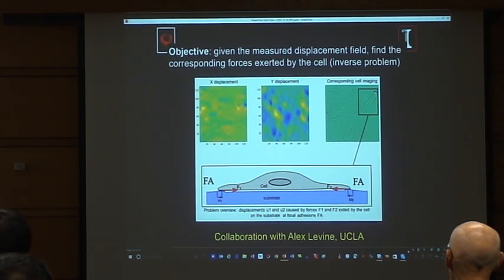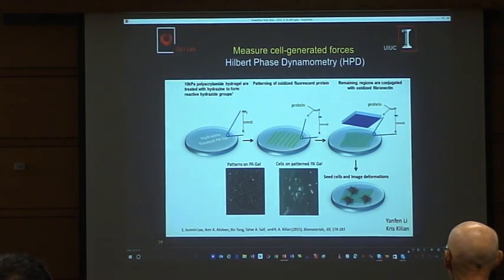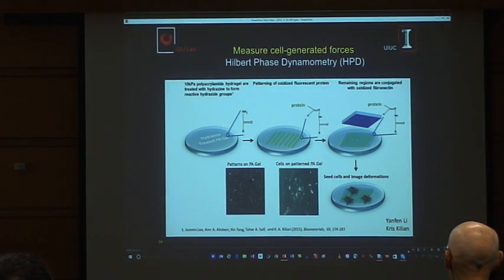We said, how about instead of putting beads, we build on this idea of deformable substrates, but we stamp them with a grid. It's the idea from interferometry, since we are biased for the rest of our life. If you measure the deformation in this grid, essentially that translates into the phase. If that was an interferogram, this deformation will be the phase captured by that interferogram.